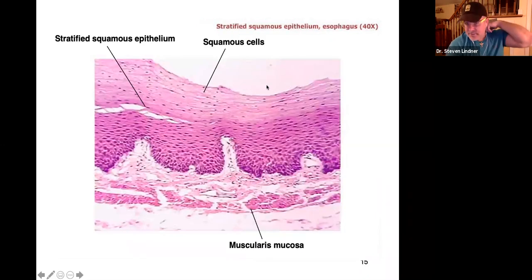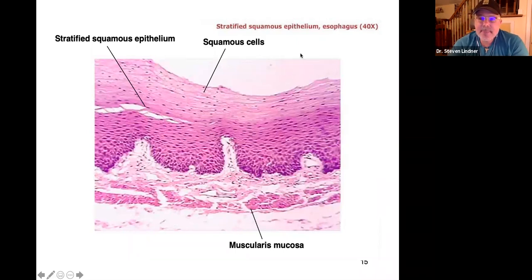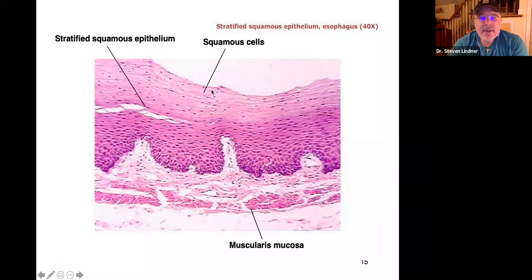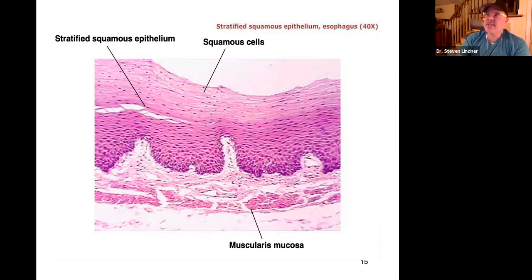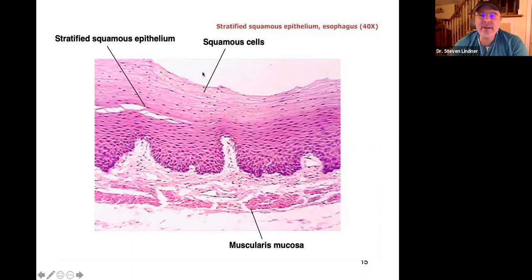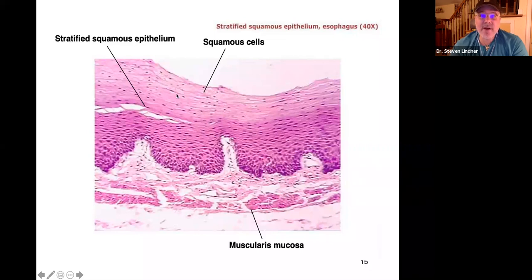Now we're looking at the esophagus. This is the lumen where food travels down. Here we have many layers of flat, irregular-shaped cells — squamous cells, but not simple. If it were simple squamous, a sharp food particle could damage that single layer. Because hot, cold, and solid foods pass through the esophagus, you want many layers of protection — maybe 20 to 30 layers of stratified squamous epithelium.